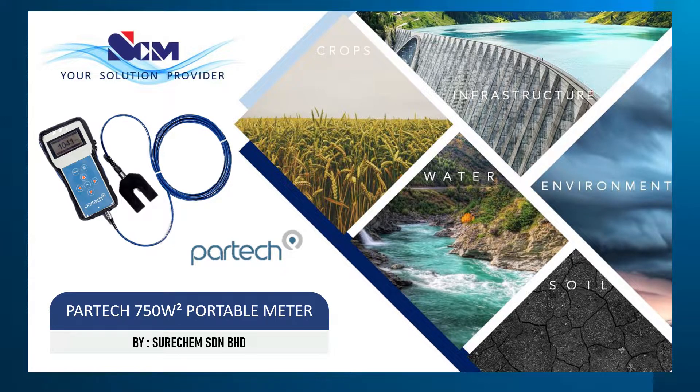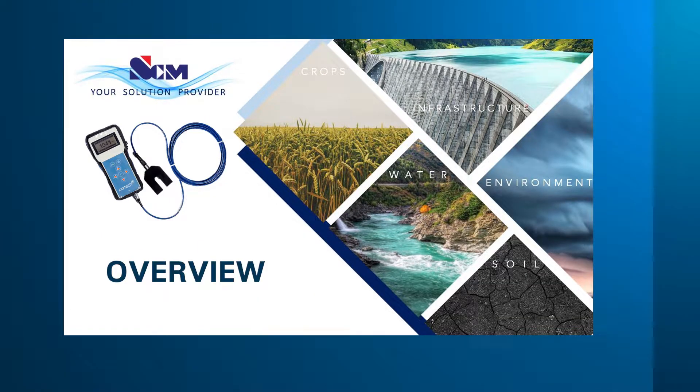Hello, today I will be introducing the PARTEC 750W2 Portable Meter. This is an overview of what is inside the package.